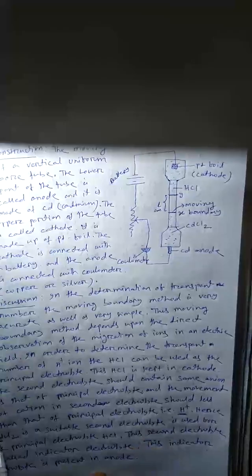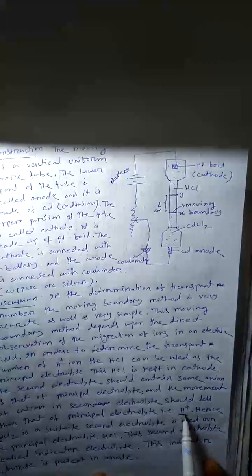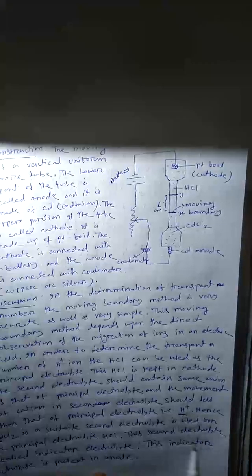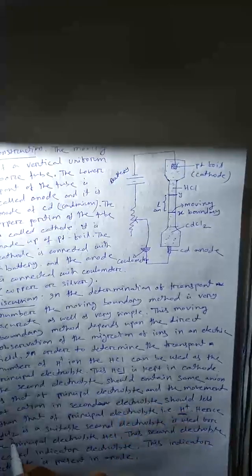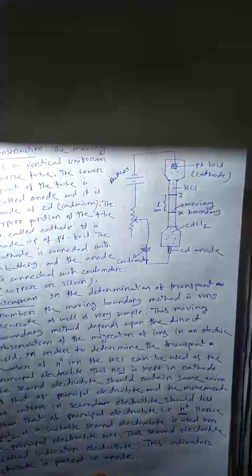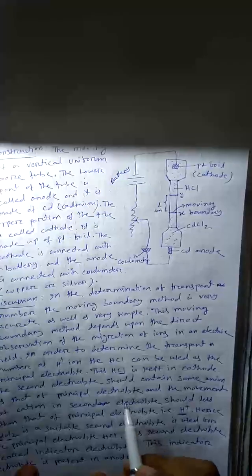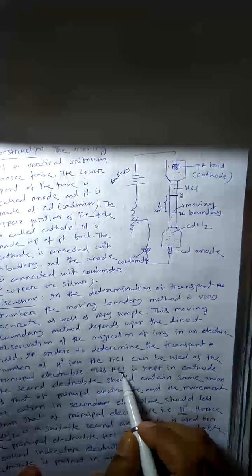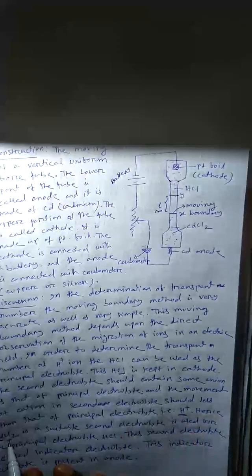A second thing is that whatever anion is present in the principal electrolyte should also be present in the indicator electrolyte.